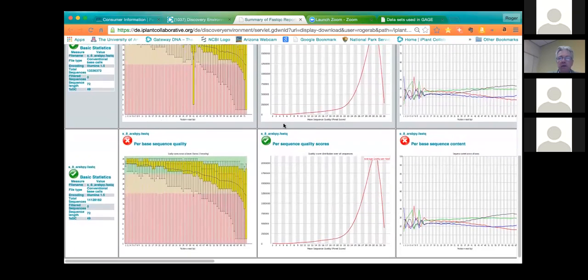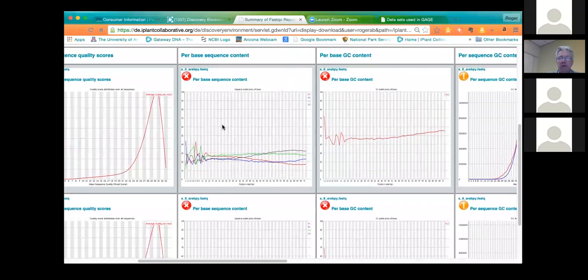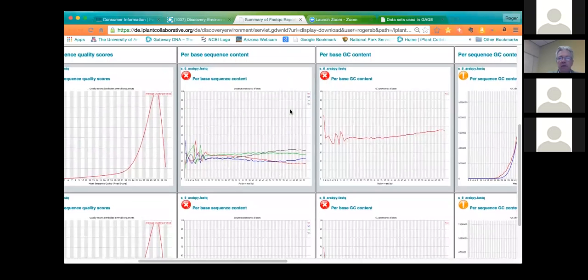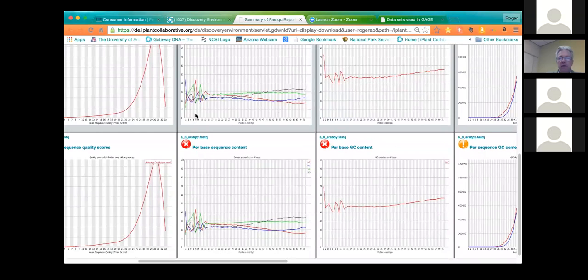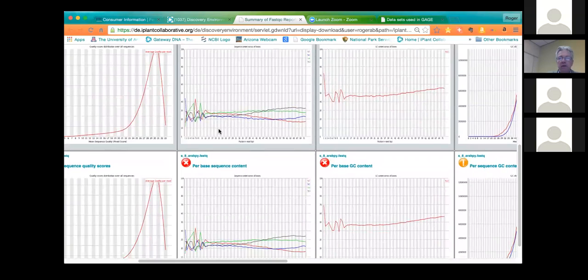of trimmer you're going to use. Take care of that. Another problem that I see in these data, and that you will see periodically, not just in my data, I've seen it in other people's data fairly frequently. Instead of a fairly flat distribution of base sequence content or GC content, you see this jumble of peaks, suggesting, as far as I can tell, that there are some repeated sequences showing up there. And what kind of repeated sequences may be showing up on so many of the reads? Well, my guess is that they're adapter sequences or primer sequences.